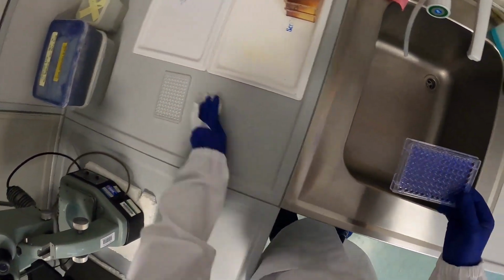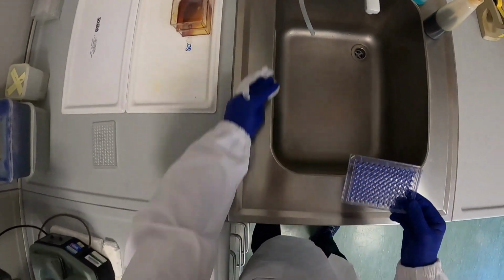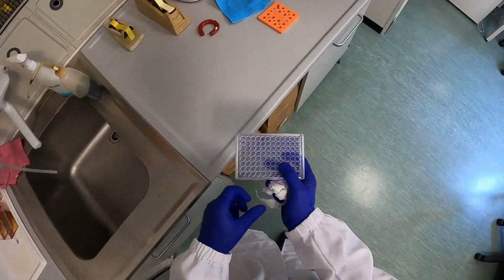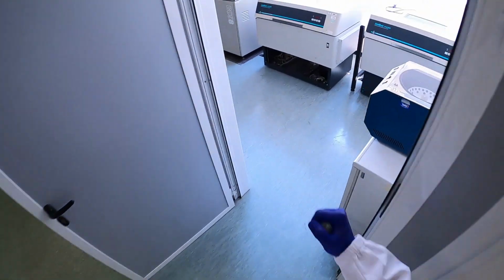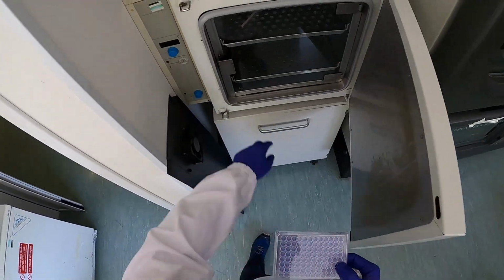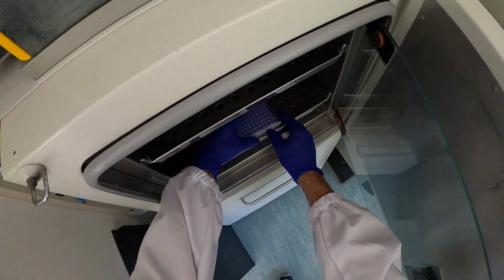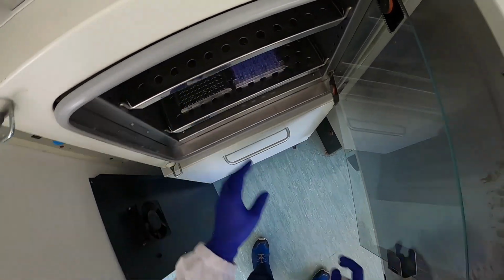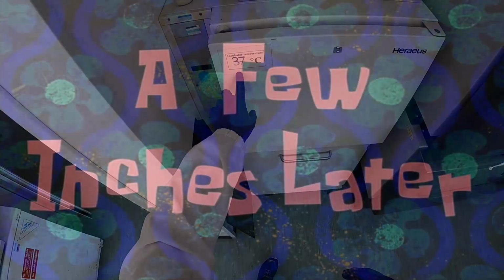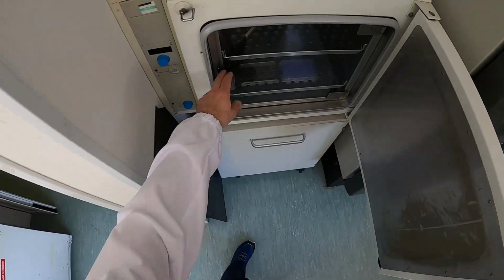Let's remove all evidence that we have ever been in this room, and let's take the plate to the incubator. At the end of our corridor we have an incubator room, and there's this stove, this incubator, which is at 37 degrees. Just take the lid off and leave the plate in there for as long as necessary. A few minutes later. Yes, it really doesn't take that long to dry the plate often.